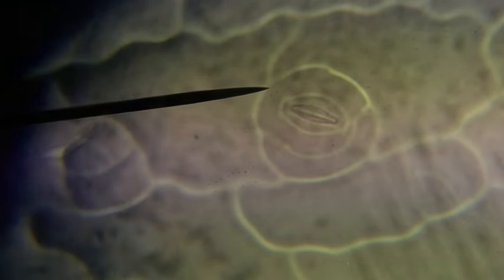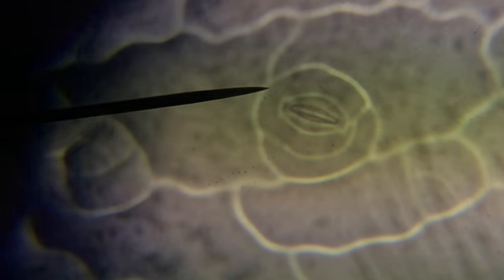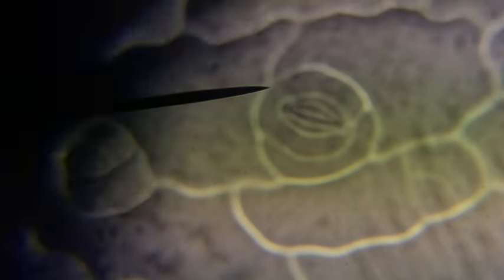So you can see the guard cells, you can see the pore, the opening, pretty well. Probably look a little nicer without having to look under the iPad camera, under the microscope.